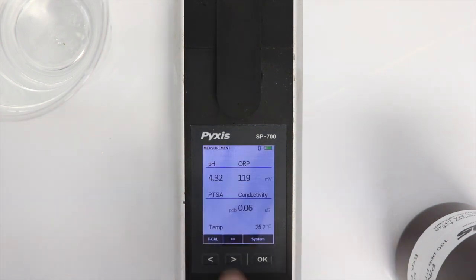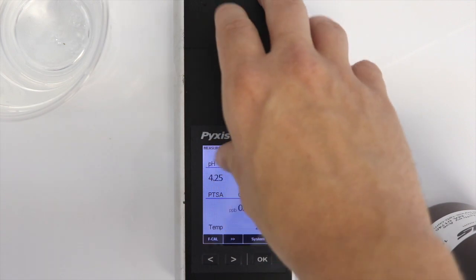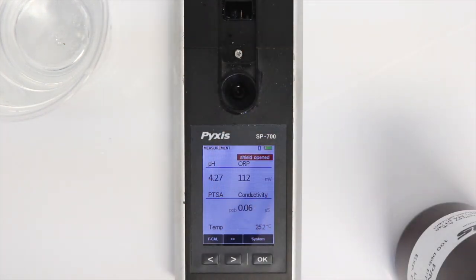Press the OK key to turn on the unit. Open the shield and insert the DI water.